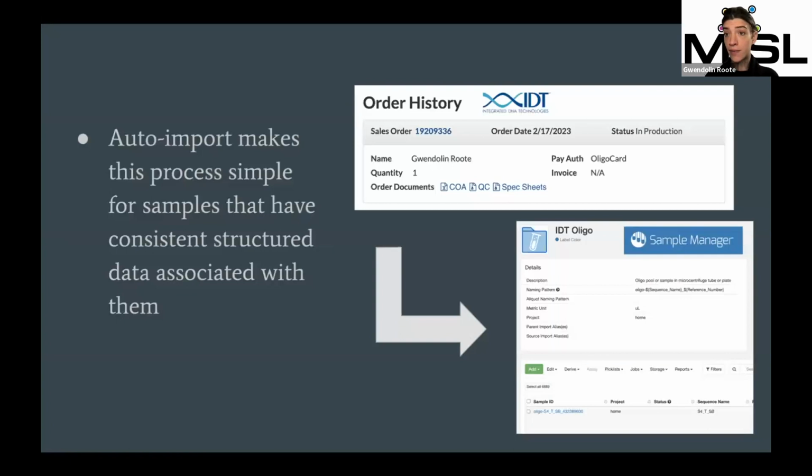The auto import functionality. So like I said, we have thousands of DNA samples. A lot of those DNA samples come from the same places. So there's a few companies that make synthetic DNA. IDT is one of them. And I will say that the IDT website is not the simplest to navigate.